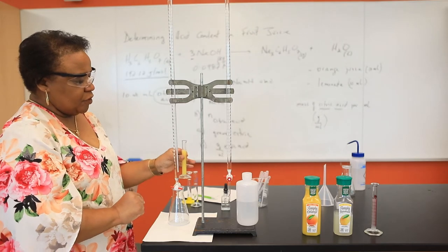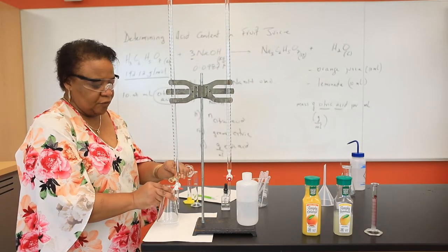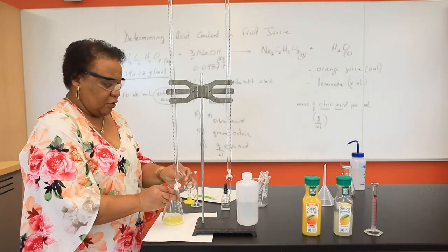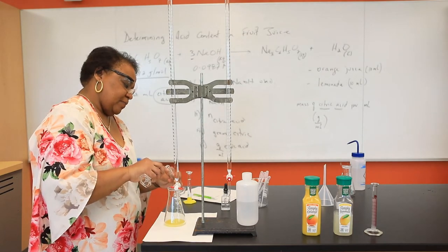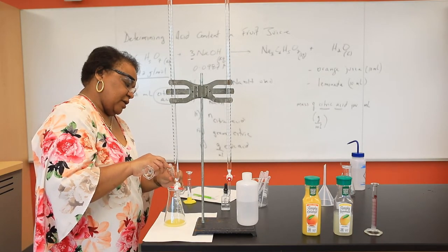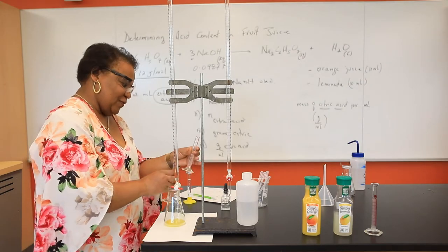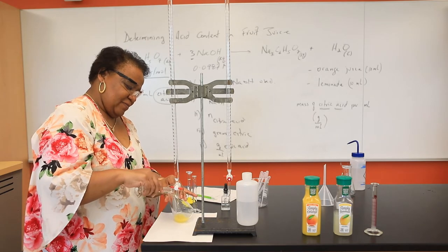In both cases, I'm going to be using 10 mLs of my fruit juice. I'm going to transfer that to my Erlenmeyer flask. And then I'm going to rinse my graduated cylinder with 10 mLs of water.